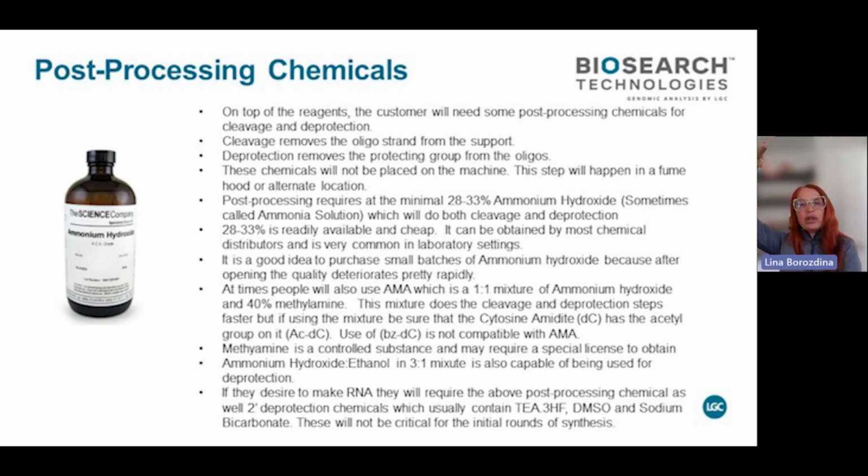People sometimes get a 4-liter bottle to do 200 microliter reaction over 5 years. In about 20 opening and closing the bottle, the ammonia will actually exhaust itself. The percent will go down quite significantly, and your cleavage would not work. So you would lose your oligo, it would still sit on the bead, or your protecting groups are not going to be removed properly. So you will lose your yield and return on investment, so to speak.